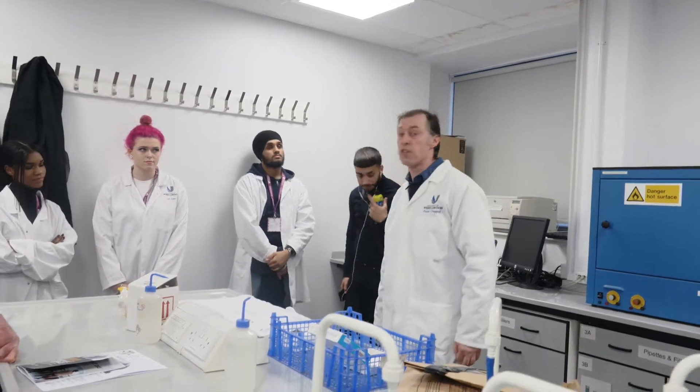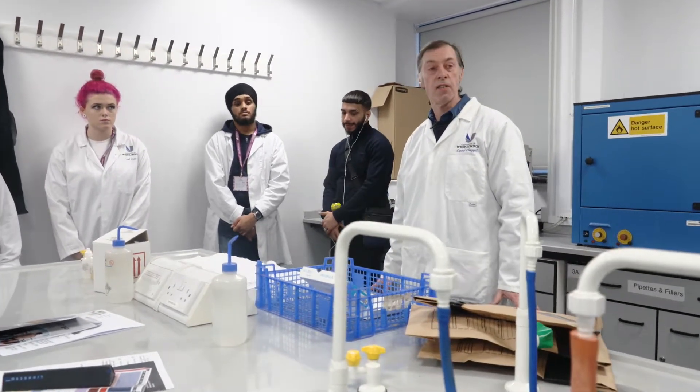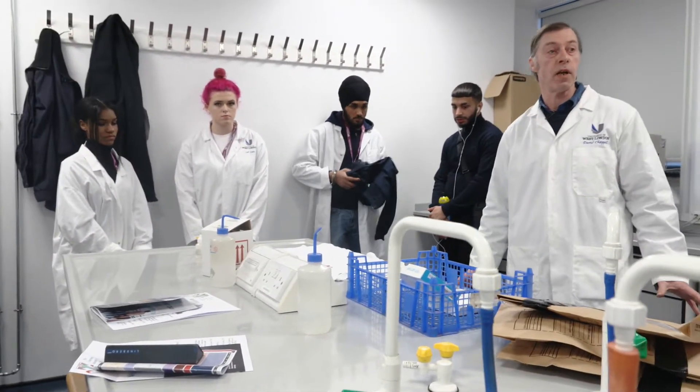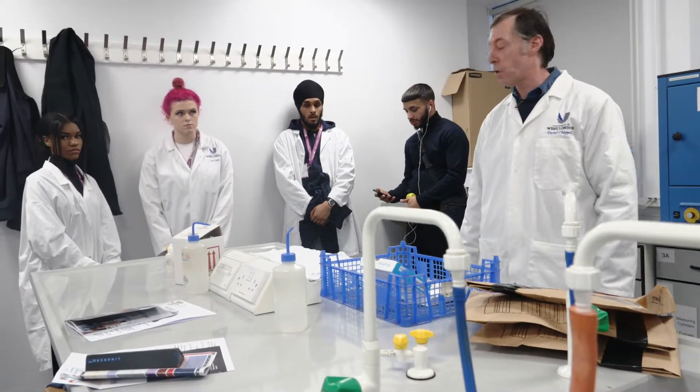We're in the Forensic Science Laboratories at the University of West London and we're going to look at a presumptive test for blood staining. So if you go into a crime scene room you might see a stain there. You don't know if it's blood or not, you can do a quick test to ascertain whether it is blood.